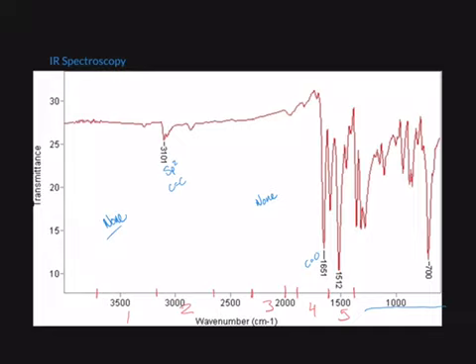Lastly, in Zone 5, we see a pretty significant dip at 1512, and this could possibly be due to a nitrogen to oxygen bond, but we're not 100% sure on that. Also, I know we said that we usually ignore the fingerprint region, but this 700 over here can also indicate nitrogen to oxygen bonds.